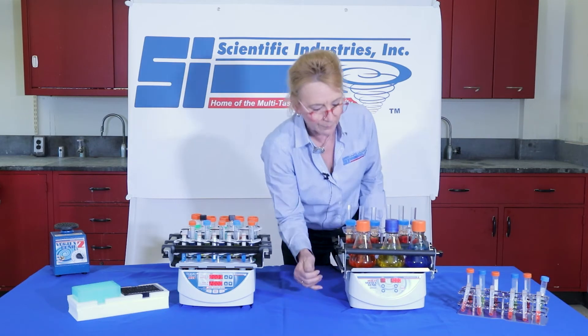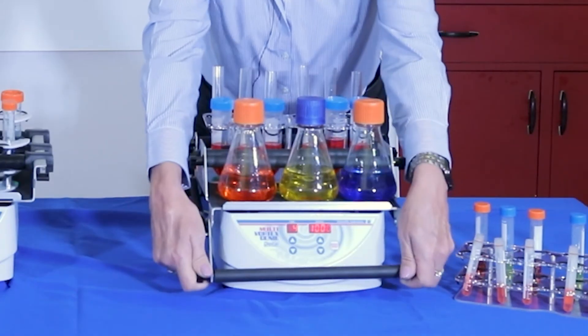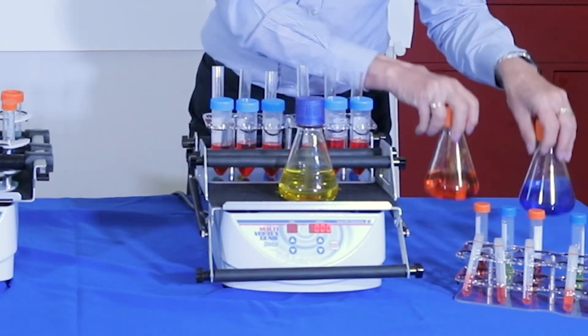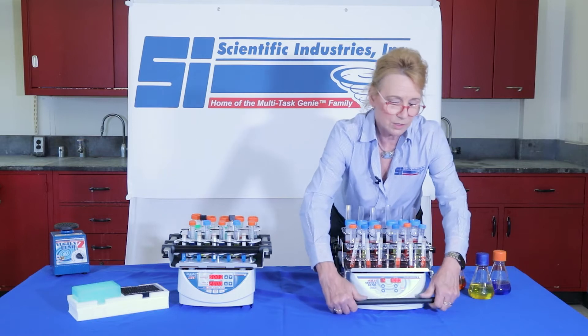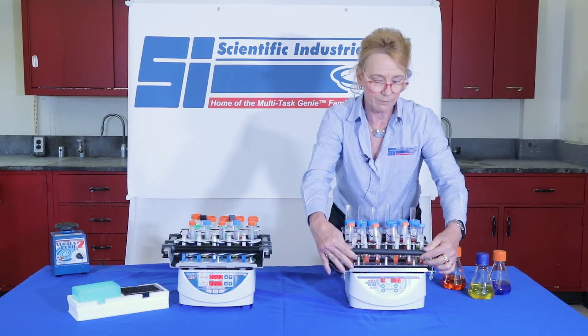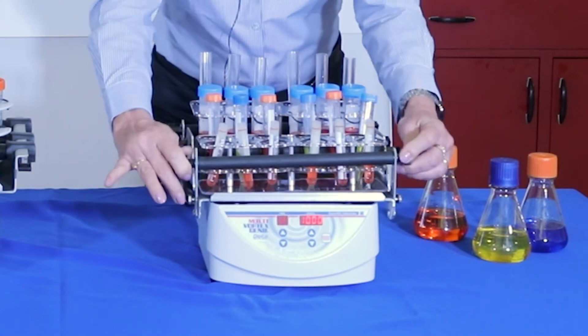So if we turn this off to load and unload — very simple design, it's spring loaded. Load it back up. It's a spring loaded bar. Make sure your bars are tight.